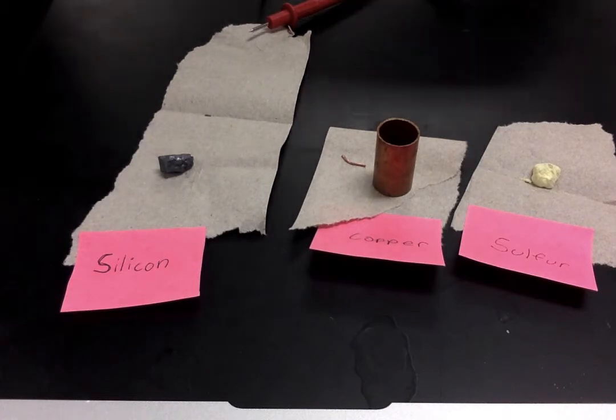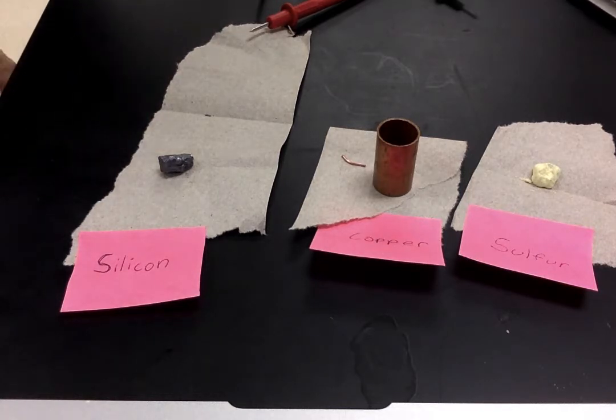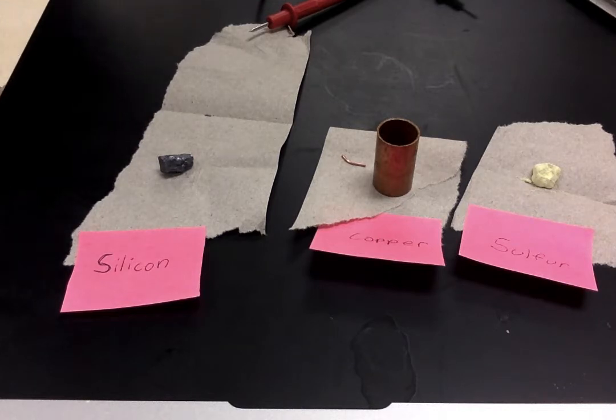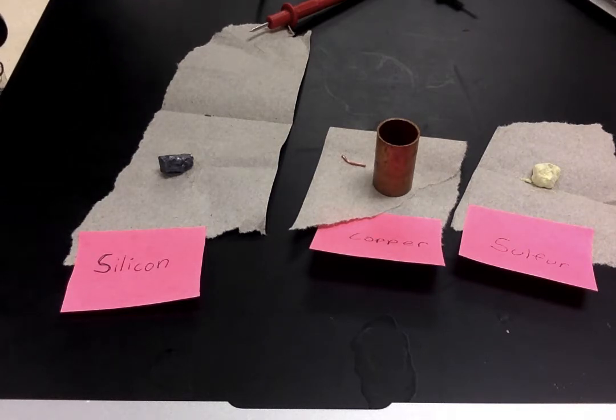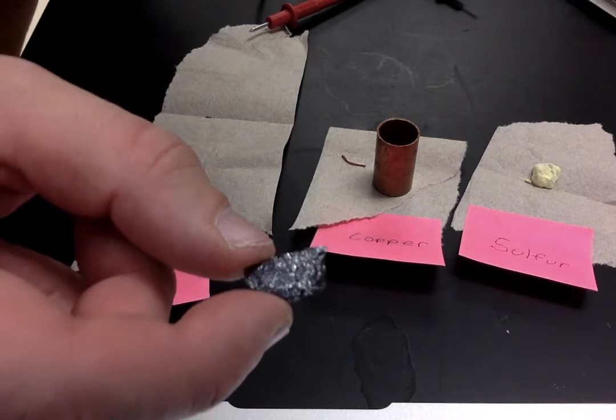Okay, so then the next thing that we're going to look at is luster. Luster is a fancy word for shiny. So the shinier something is, the more luster it has, and the duller something is, the less luster it has. So let's take a look at these three one more time and try to determine which one is the shiniest. You'll rank that one as number 1, and then which one is the dullest, and you'll rank that one at number 3. So here we have silicon.